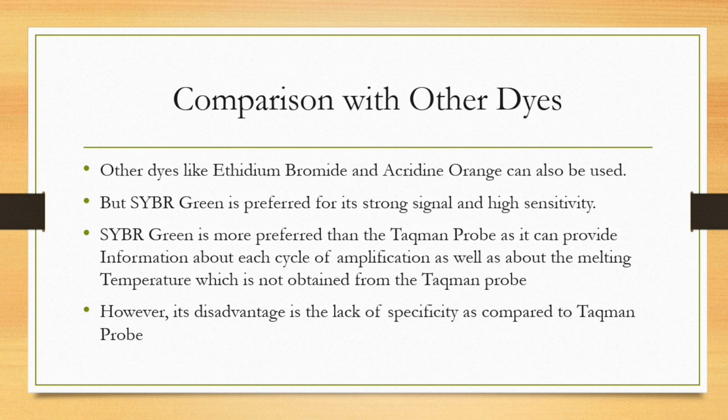Comparison with other dyes. Other dyes like ethidium bromide and acridine orange can also be used. But SYBR Green is preferred for its strong signal and high sensitivity.